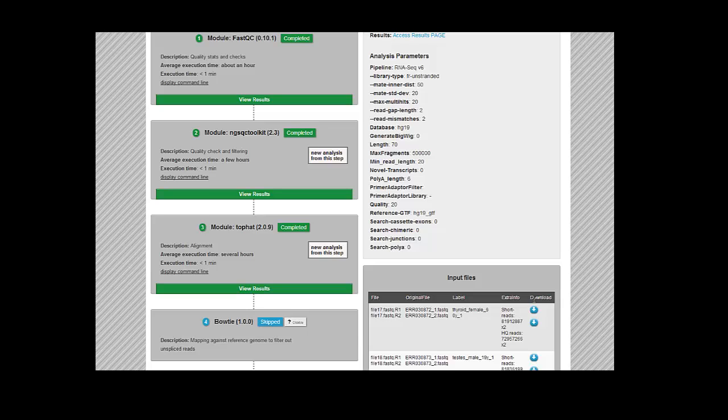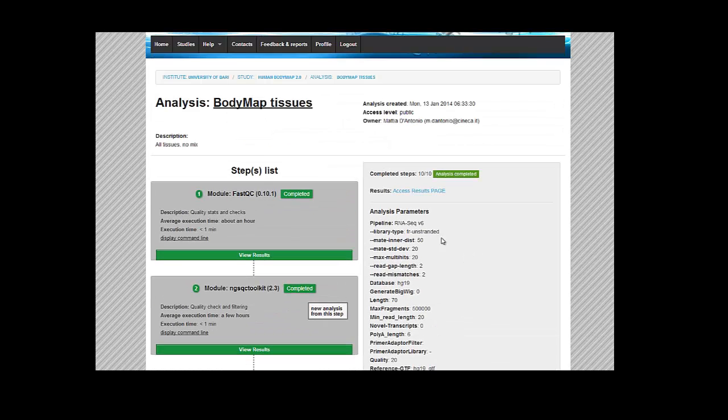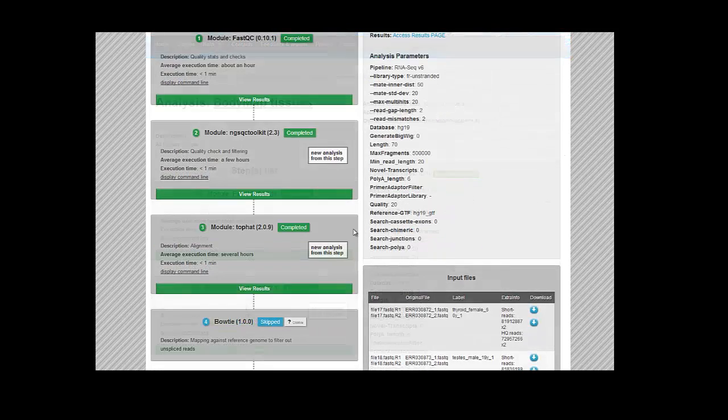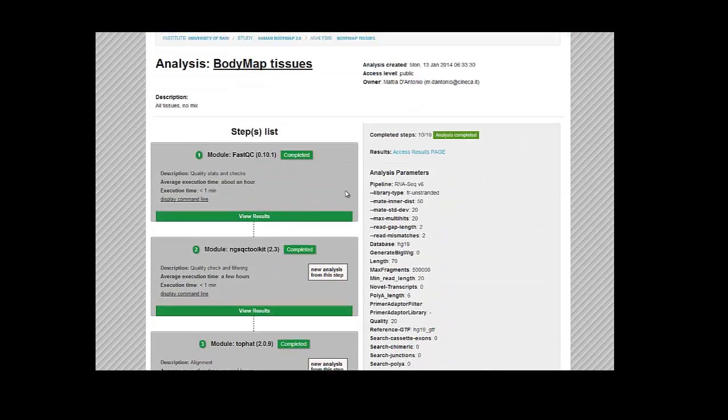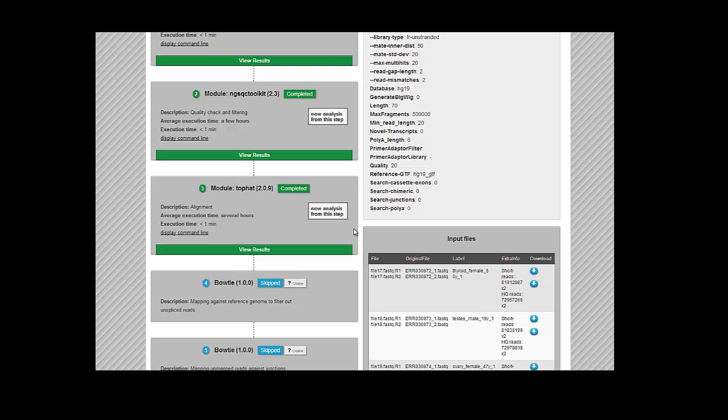So here you have all your input files, all the parameters that you used. From here you can restart an analysis by clicking on the New Analysis from This Step button, and you can just change the parameters from that point onwards. So if you want to do further testing on your analysis.